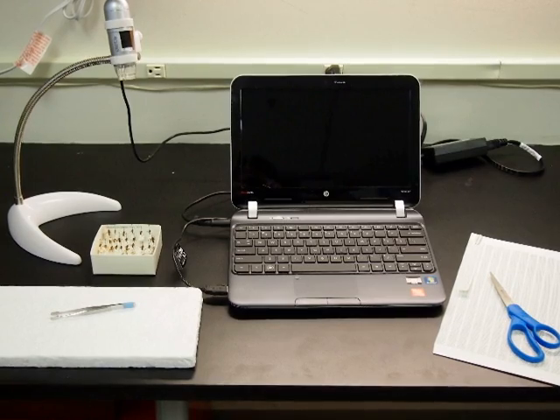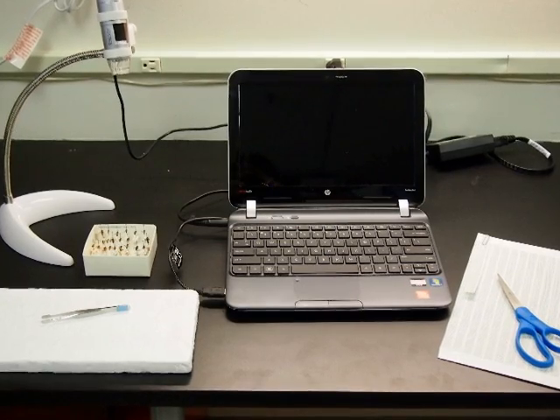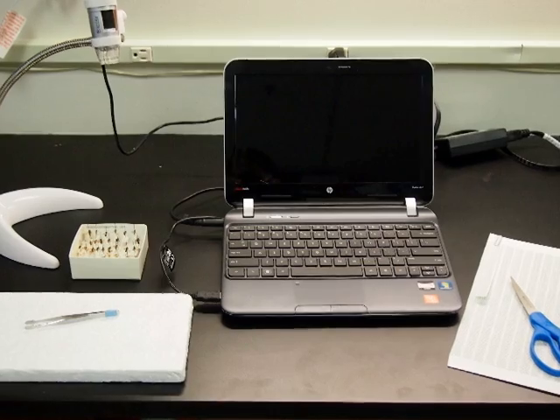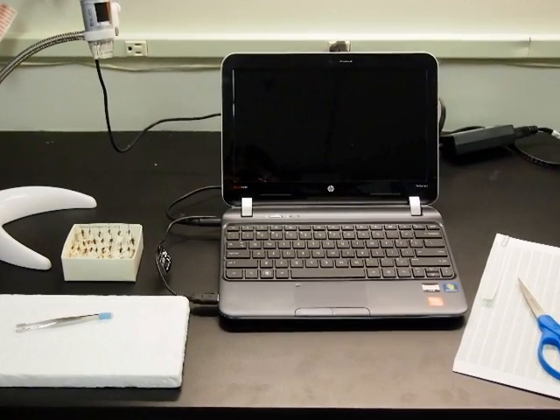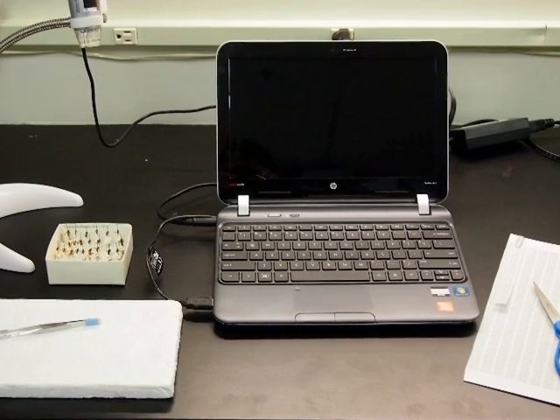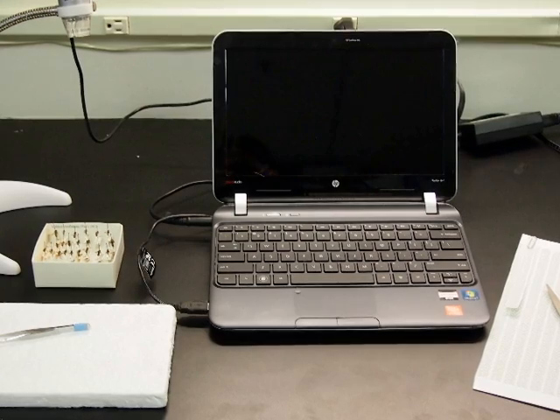Prior to imaging specimens, you will need the following: a tray or drawer of insects, a DinoLite digital microscope camera, a computer, a sheet of catalog ID numbers for the museum that you are working at, scissors, a pair of forceps, and a white styrofoam block to place specimens.